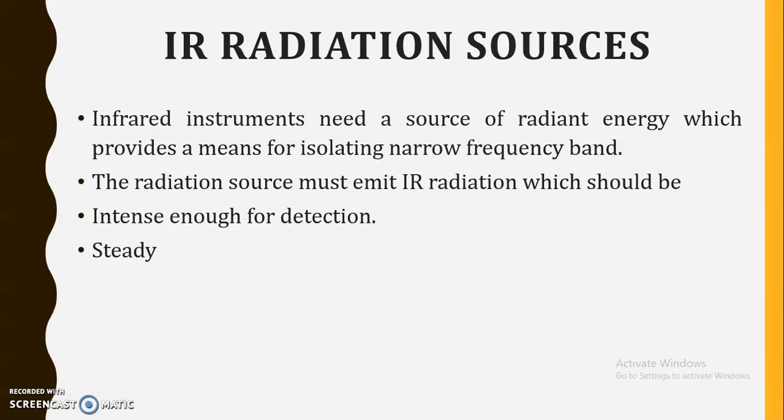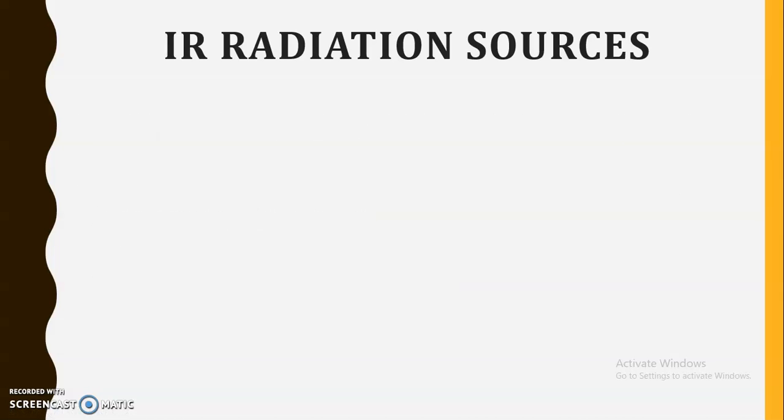Then they must be steady, and they extend over the desired wavelength. So these are the various characteristics that an IR radiation source possesses.